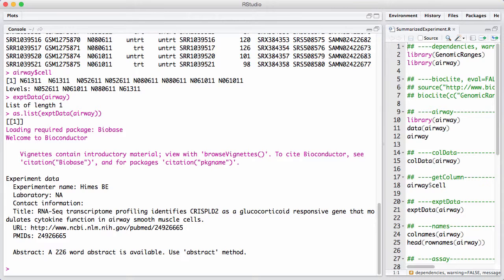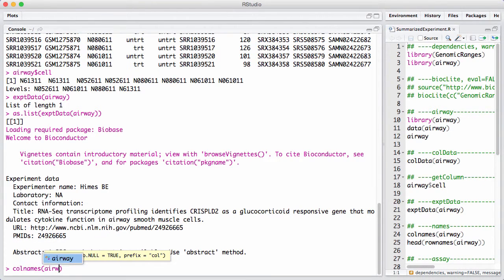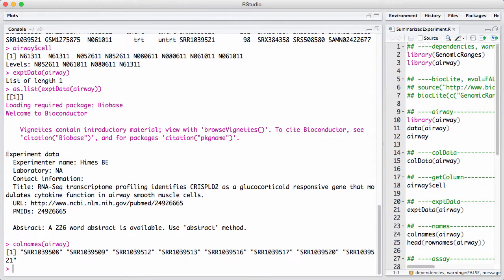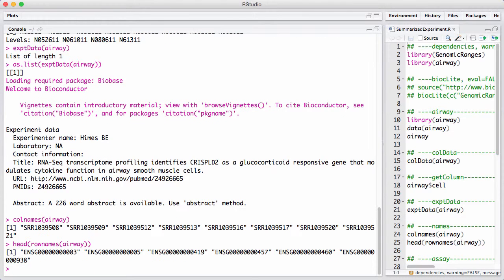We no longer have sample names — we only have column names, which are really the names for the different samples. And we don't have feature names, we have row names. We can see that the feature names look like Ensembl gene identifiers.